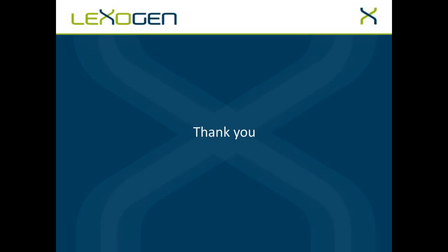Very good. Now, do we have to use all three sets in each sample, or can we use different E-sets in different samples, like controls and experimental? That's a really good question, and it actually addresses the different applications of the SIRVs. If you want to validate your pipeline or look at differential gene expression, then you would spike in different SIRV mixes into different samples. Let's say in sample A you spike in E0 and in sample B you spike in E2. And then you can assess the accuracy of differential gene expression on a transcript level.